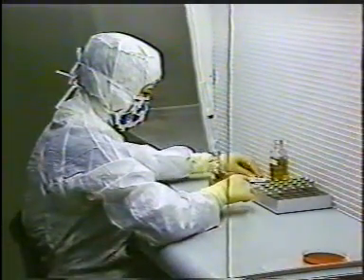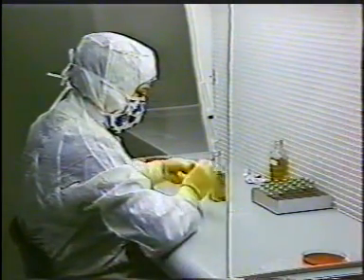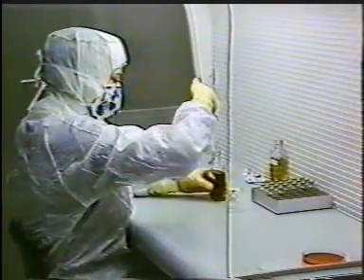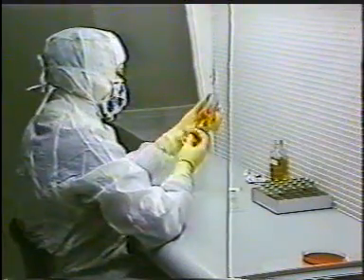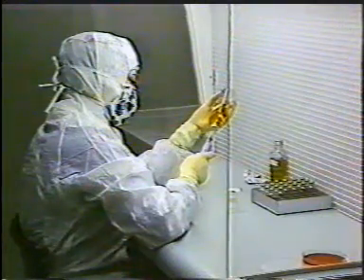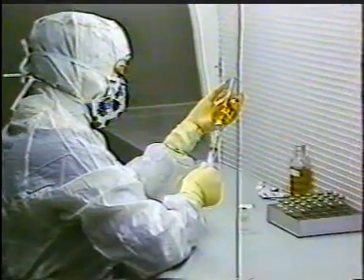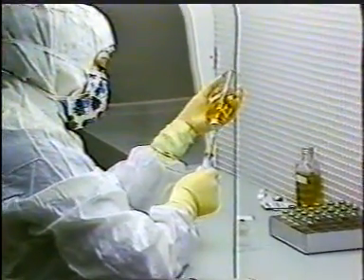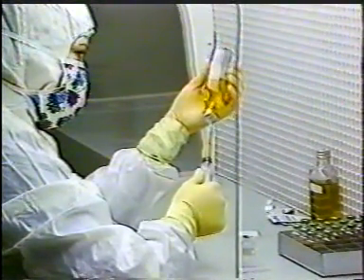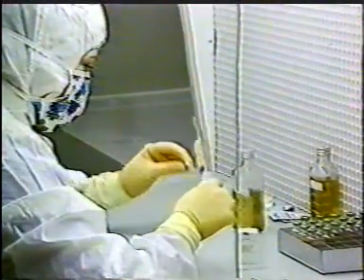In addition to monitoring the standard of the manufacturing environment, it is necessary for certain operations to monitor operator technique. This is particularly so for aseptic work. Consequently, during the period of induction and training, and at specified intervals afterwards, staff are required to carry out broth transfer trials. These involve transferring sterile nutrient broth aseptically between containers, after which the broth is incubated in order to detect any contamination. It is essential that operators be able to carry out these tests successfully.